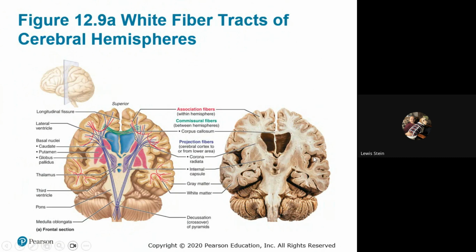You could make this cut if you want. Because you could slice these brains and take a look. But I mean, you're going to see there's, comparatively speaking, not a lot of gray, but a lot of white matter that's here. The cerebellum, you can see, is distinctly different with the way the sulci and gyri run. But here's that corpus callosum. It's so distinct, and you're just going to slice right down. Don't do that first. I'm going to have you look, I'll explain to you how to do it the way I would prefer. So here you can see these fibers that crisscross.